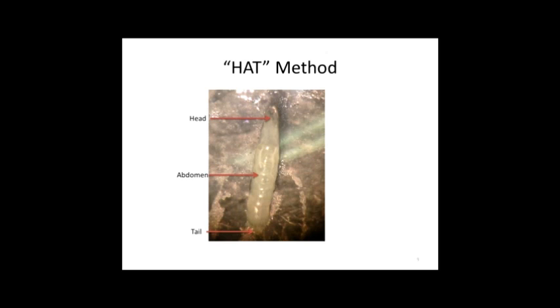This leads me to the behavioral assay that I used in my test. After many different experiments, testing sensation and sensitivity on different parts of the third instar larva, it was obvious that the head was more sensitive than any other part of the body. So first I would use this pencil connected with clay on the top of the pencil with an insect pin pushed into the clay. And this is what I used to touch each part of the larva.